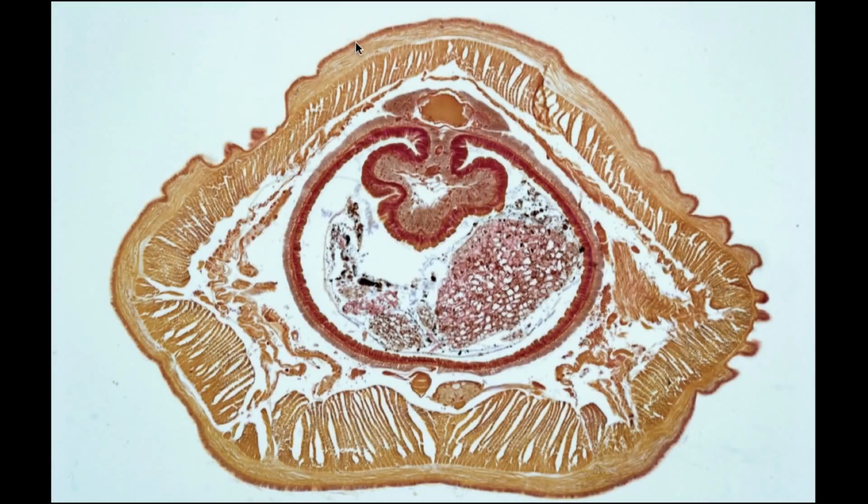The epidermis with its cuticle, circular muscle, longitudinal muscle, coelom, metanephridium, dorsal blood vessel, intestine. You can even see some food in the intestine here. The typhlosole. Down here is the ventral blood vessel and the nerve cord.